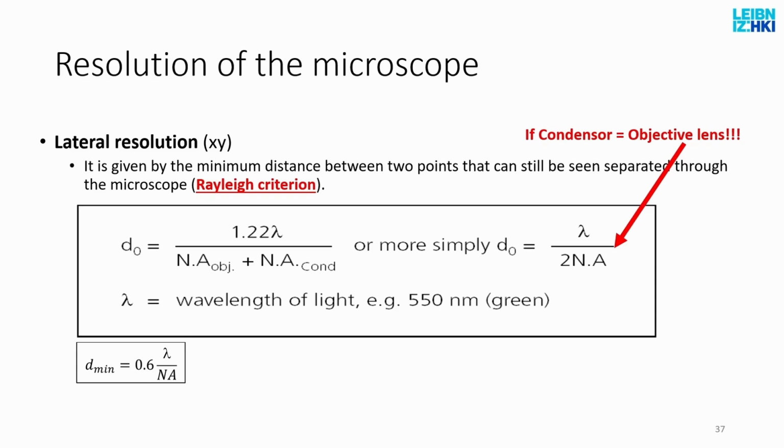And then we will talk very soon about how to set up the pixel size to take advantage of the optical resolution. So there's a digital requirement and there is an analog requirement. This also means that the wavelength of the light has a tremendous effect on the resolution. So if you go from 400 to 800 nanometers, from deep blue to red, your resolution changes by a factor of 2.